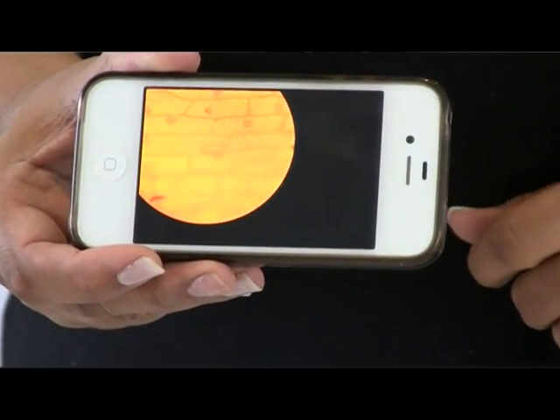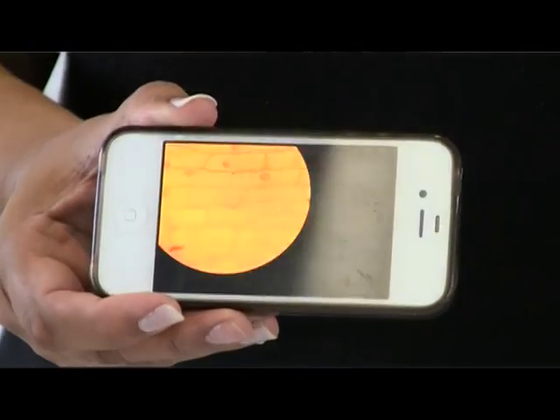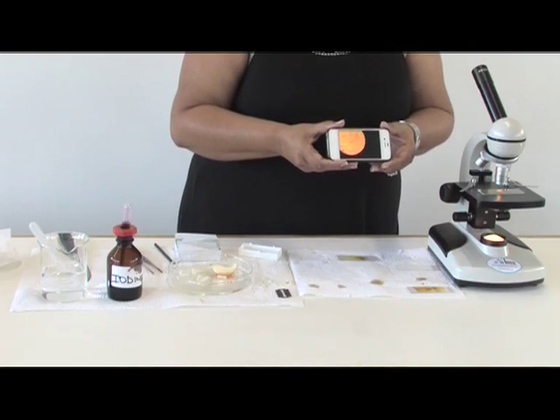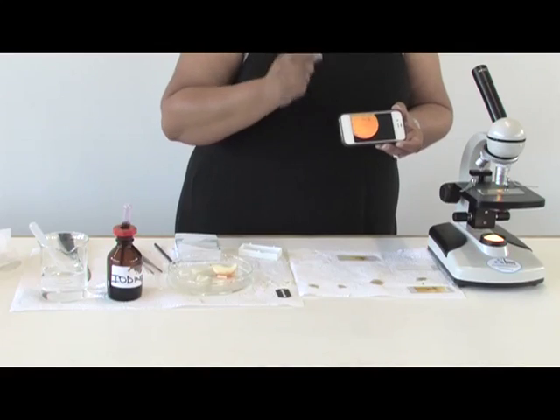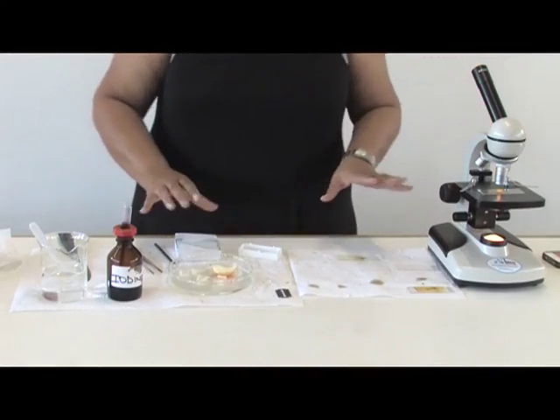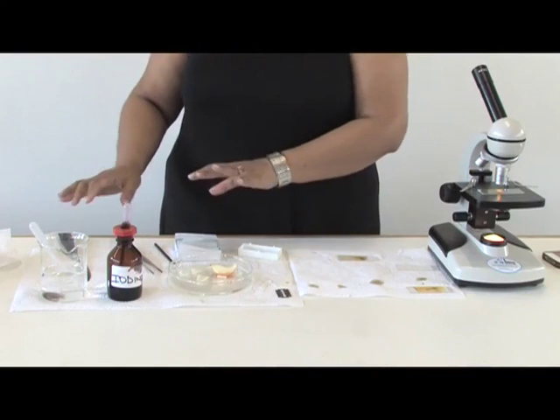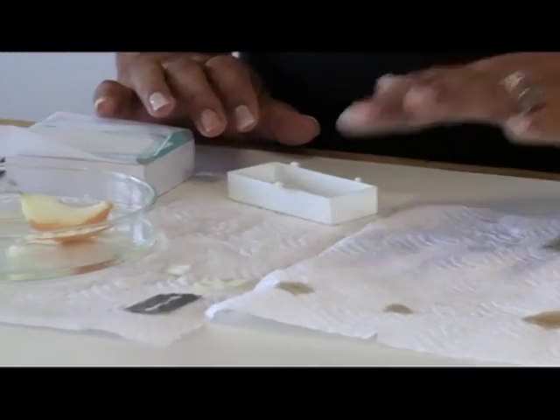This is how you make a wet mount. If you don't have a lot of microscopes, this is also a fun way of using a cell phone effectively in a classroom — Bluetooth it to the rest of the class and they can draw whatever they see from the cell phone. Once you are done, wash your microscope slides and cover slips and put them on a paper towel to dry so that you can reuse them again.